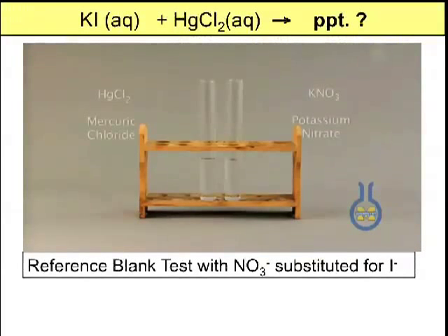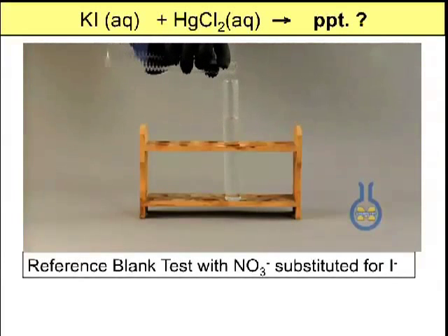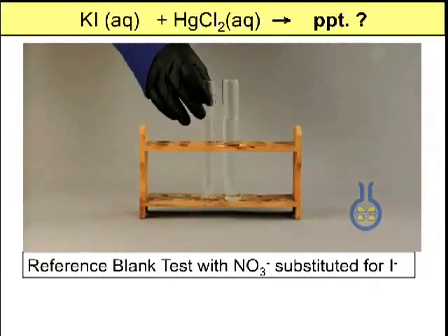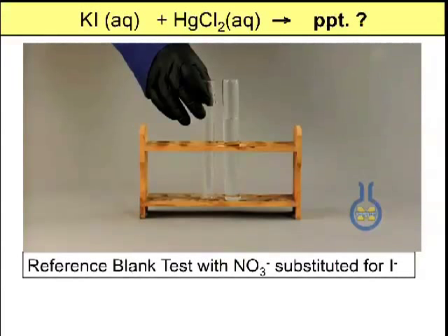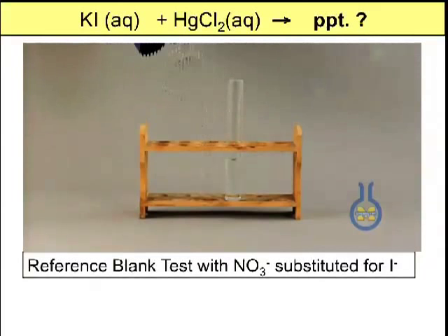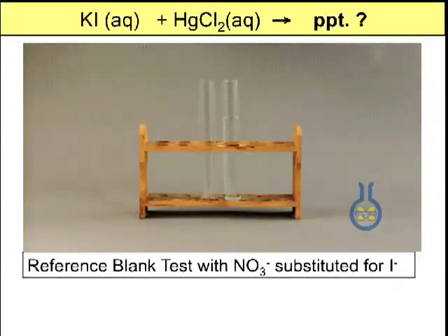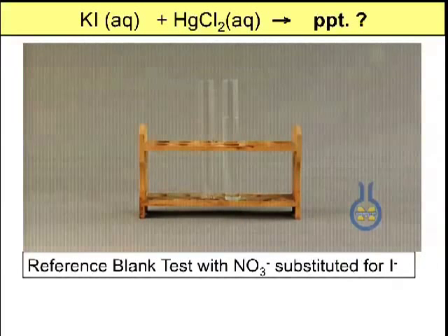Here we're going to take the reaction — stated at the top — and we're taking out the I minus and substituting nitrate. Notice they're both clear colorless samples. The original reaction listed at the top is potassium iodide. We're going to take out the iodide and put in the highly soluble nitrate. So the only thing missing is the I minus. We take the original samples with the I minus missing, put them together. We get no reaction.